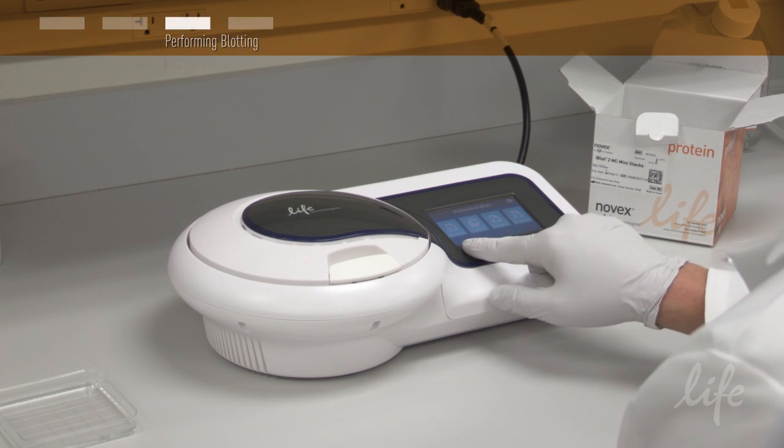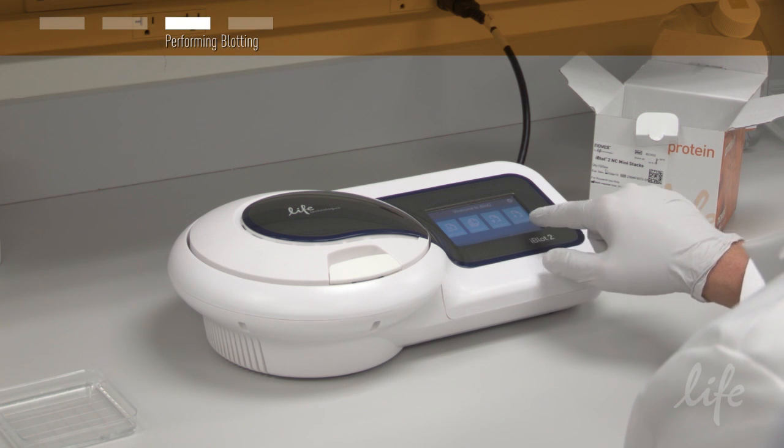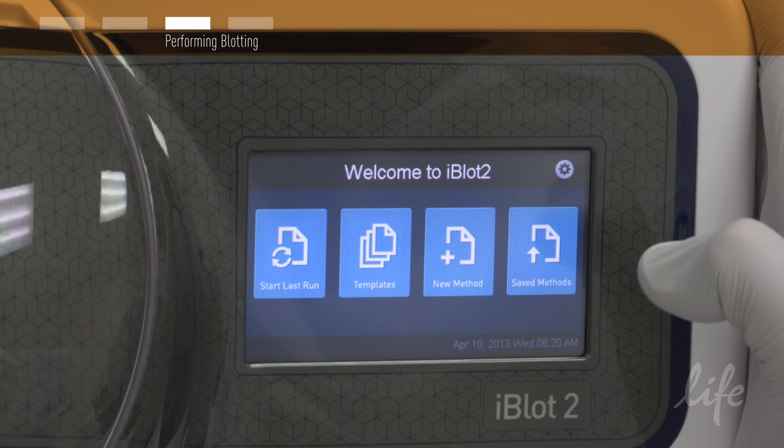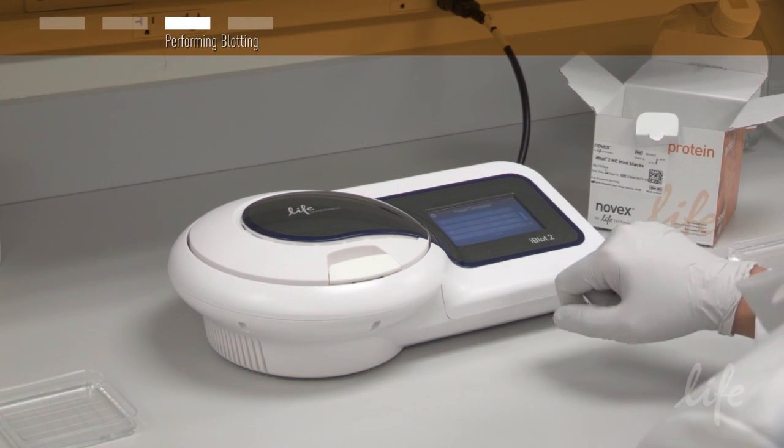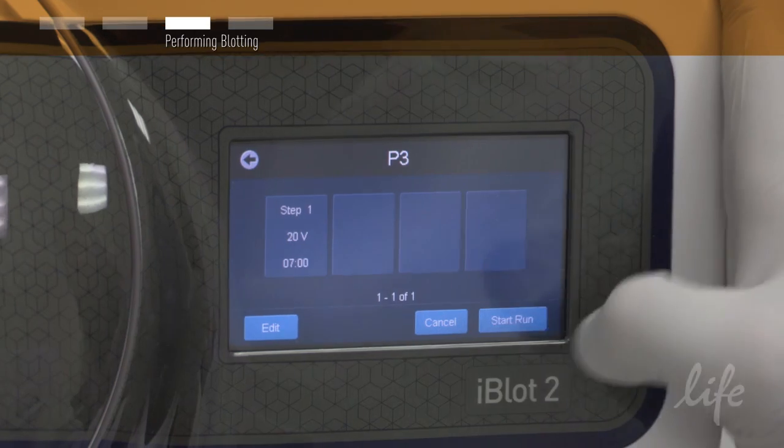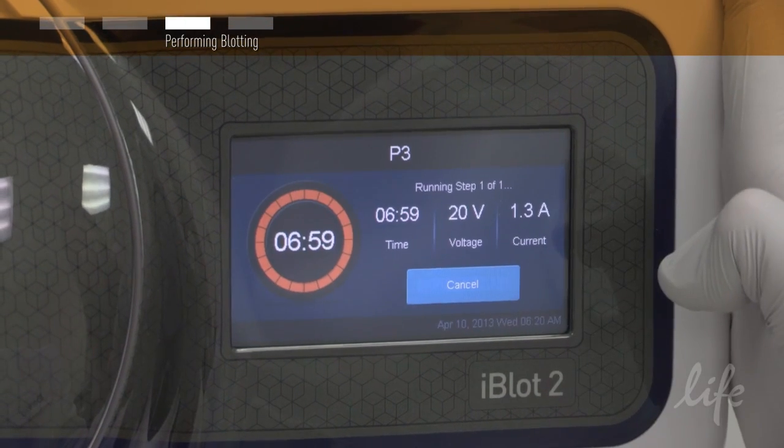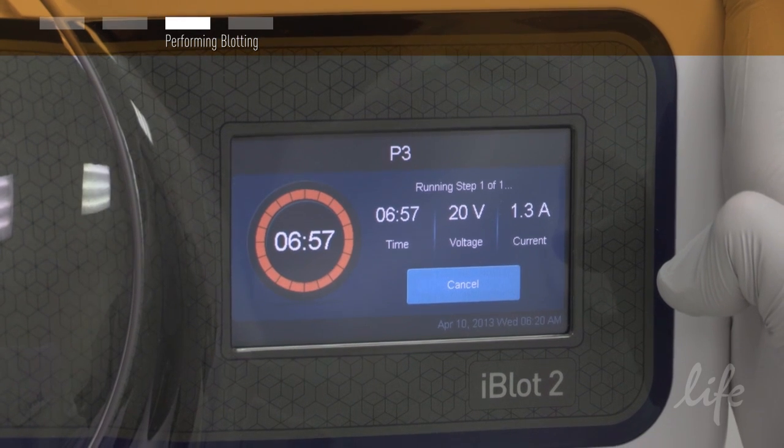Select the desired method and make sure that the parameters are correct. Notice that you'll now have the ability to create custom methods of your own or choose from our recommended preset templates. Touch start run or if desired use the start last run icon.